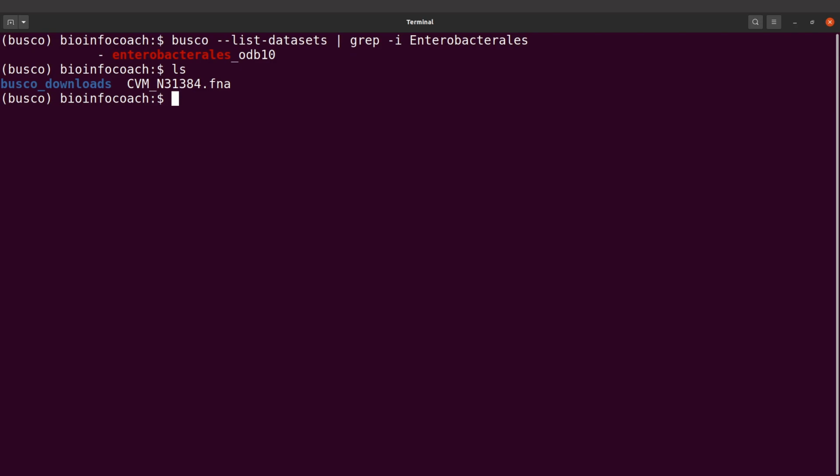So we will now call BUSCO. We say BUSCO, I'll say -m, and then I'll say genome, that is the mode. I'll say -i, I'll specify this file. That's the genome assembly. And then I'll say -o, I'll specify an output directory. So I'll say cvm, I'm using the same name here, and then _busco. That'll be the output directory.